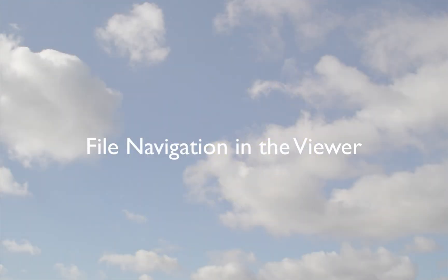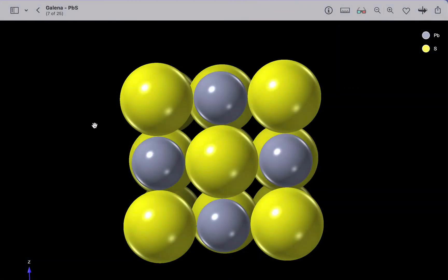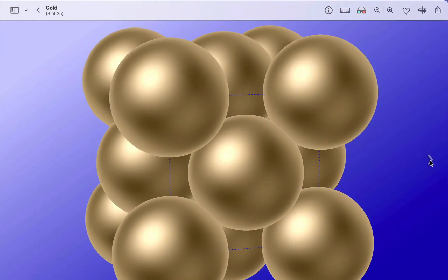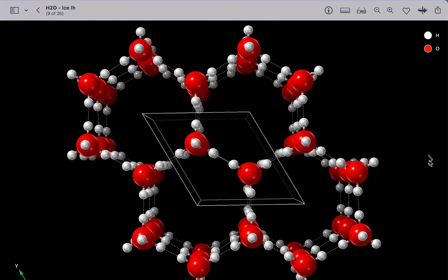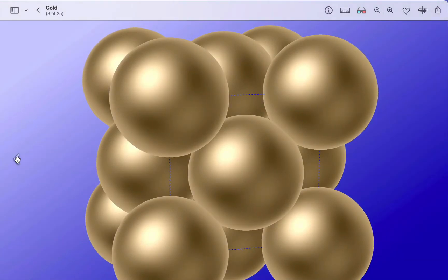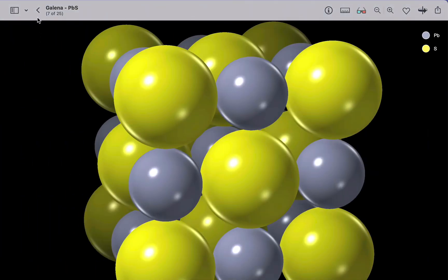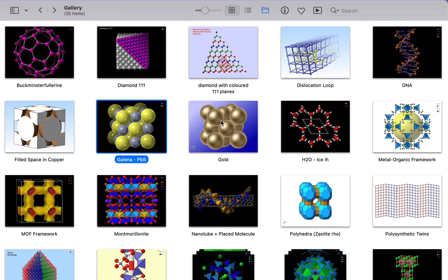And let's now look at how we can navigate between different structures. Now, if you move the mouse to the left or to the right of the screen, then you'll see back or forward buttons. And these allow us to navigate to different structures in the current folder. In fact, if we go back to the folder, you can see these were the structures on either side.